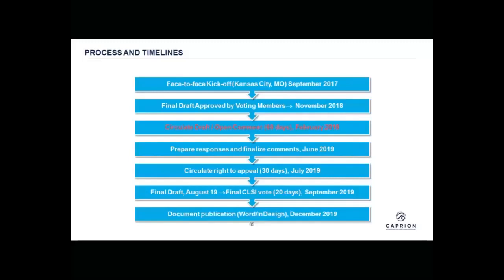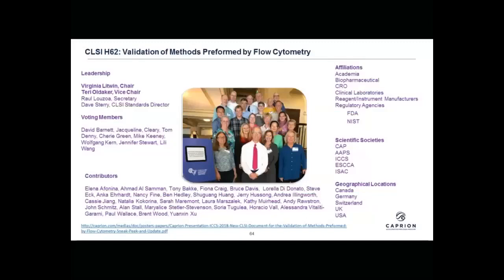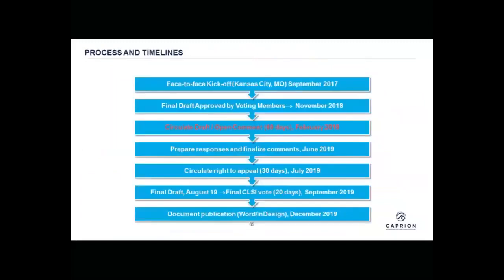And this is part of why the CLSI document carries more weight than our typical white papers. First of all, the CLSI has rules on the composition of the voting members of the committee, and we needed people from industry, professionals, as well as government reps, which are the NIST and the FDA. And the other reason that the CLSI document carries more weight is this review process. So we really hope lots of people comment on the document.